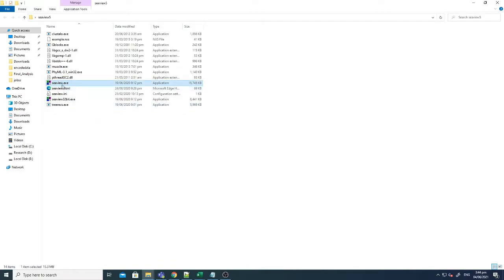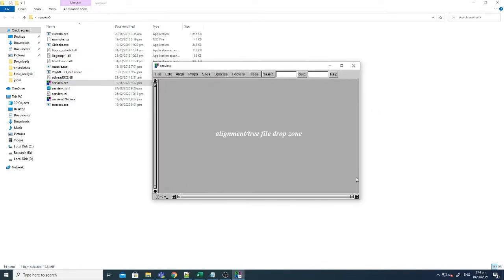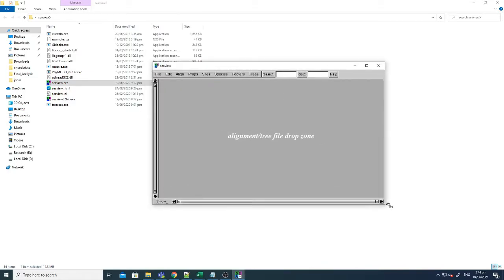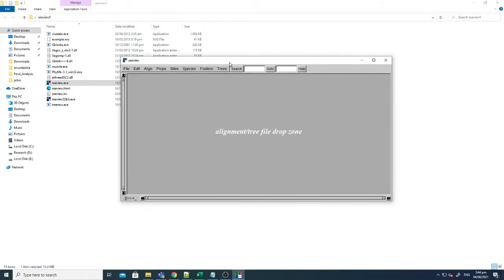You just open it. So there are multiple options, you just have to click C view dot exe, this file. Now this is the simple graphical user interface of C view.